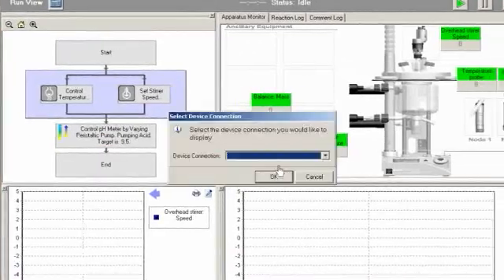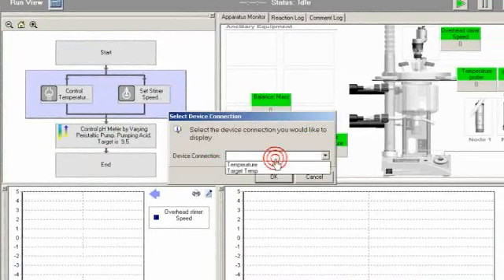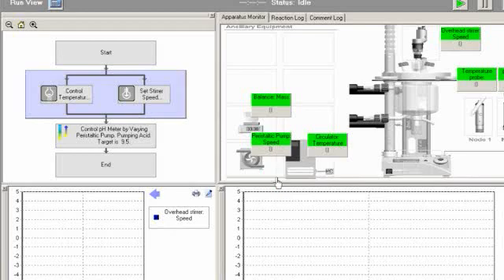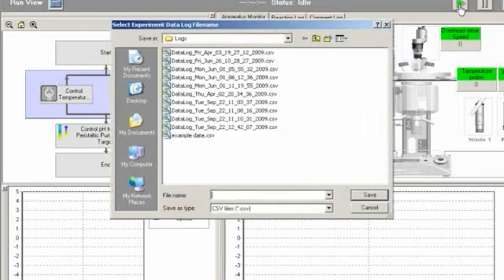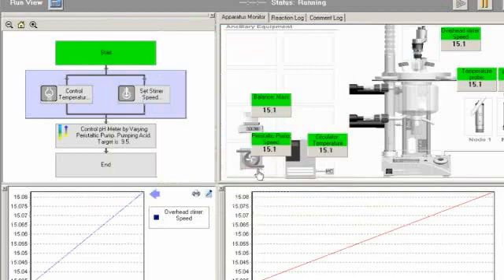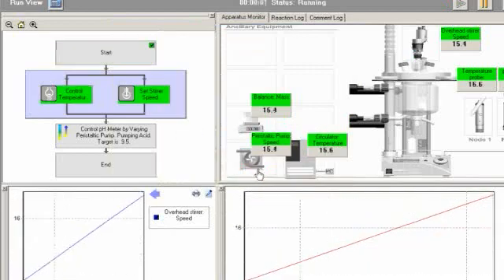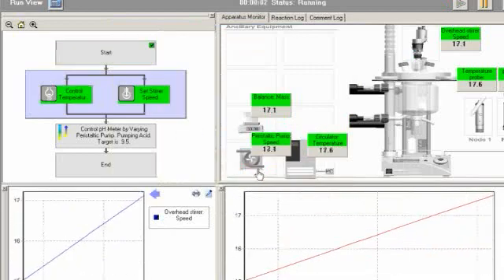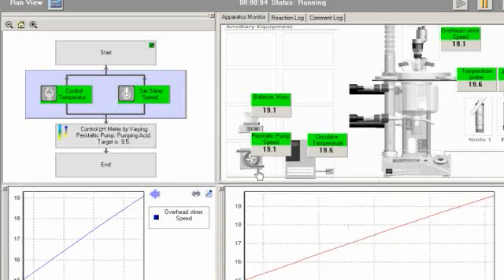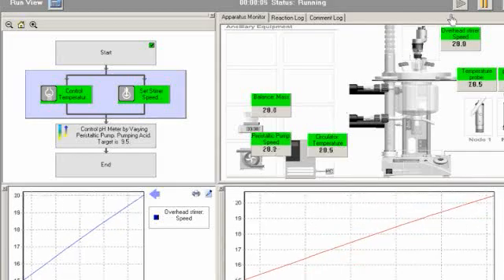Experiments can be modified on the fly and all reaction data is continuously logged to CSV data files, making analysis very easy.